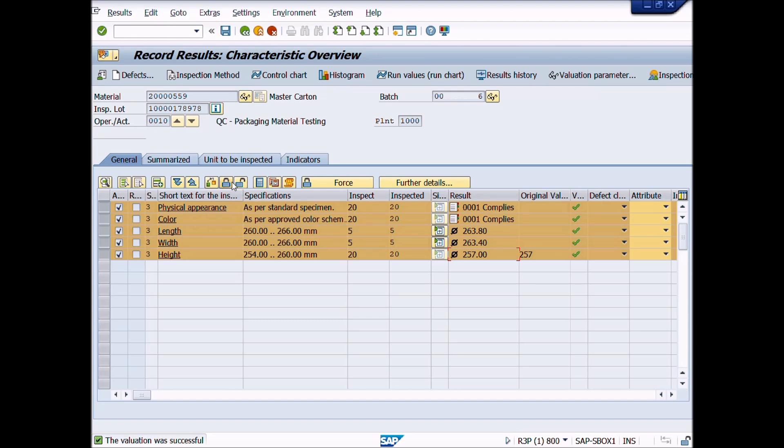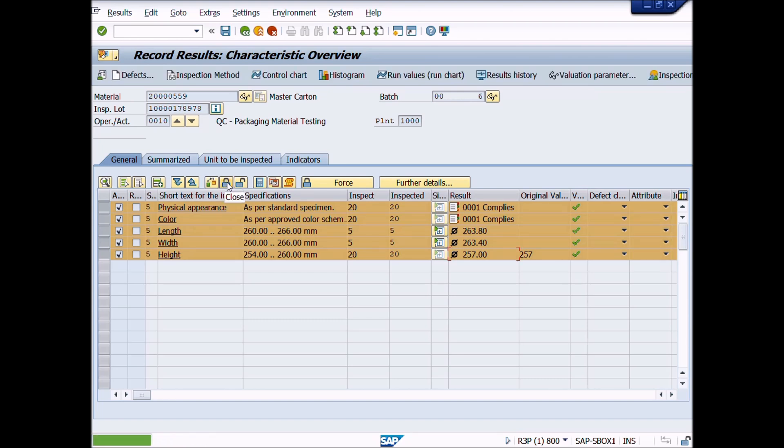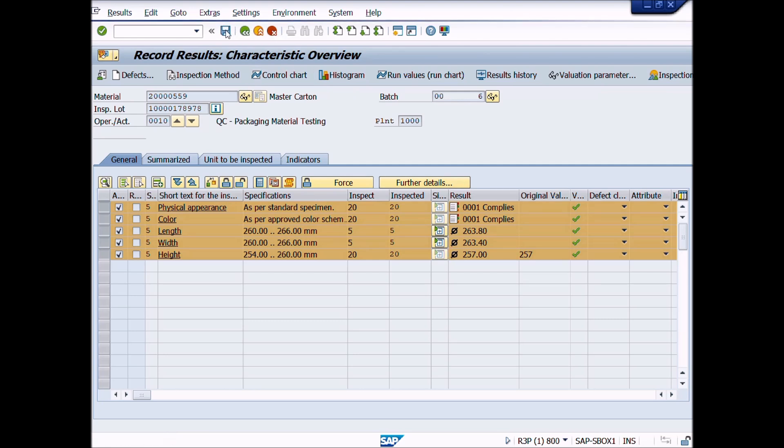Like this. A message appeared that successfully closed. Now you will click on save button to save the transaction. Great work. You have done it.